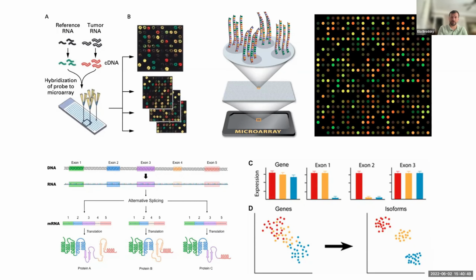So we'll talk about the differences between gene and transcript level analysis, but we'll also talk about how to look at that detail by making sure that we are actually developing a transcriptome from our own data, and only then going through the process of annotation.